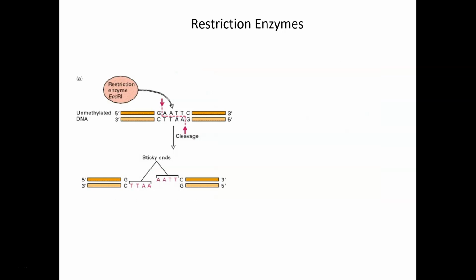So here's EcoR1 again. It's very, very common, perhaps the most commonly used restriction enzyme. And again, it binds to and cuts GAATTC, cutting between the G and the A. We see that EcoR1 is binding to the top strand and cutting between the G and the A. It's binding to the bottom strand and cutting between the G and the A. And if we separate, or denature, disanneal those two strands, we see that we are left over with sticky ends.